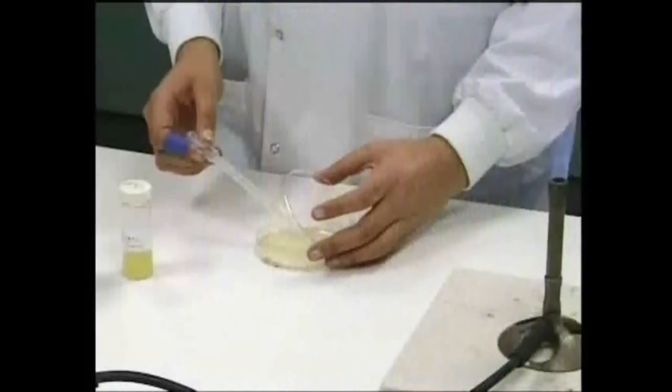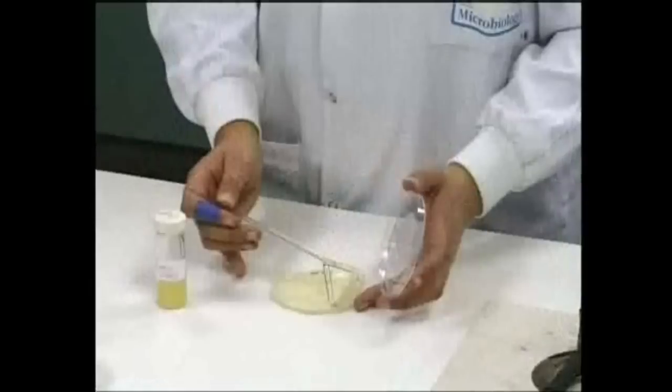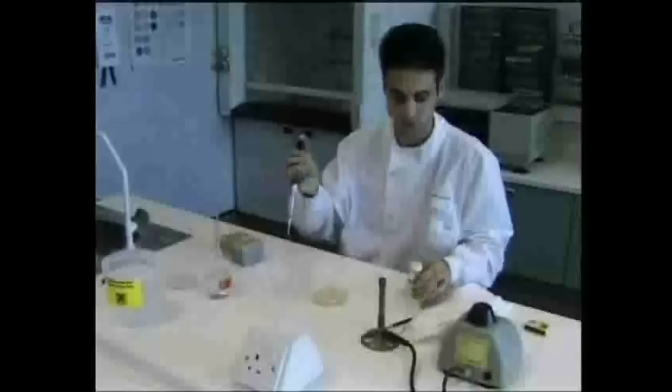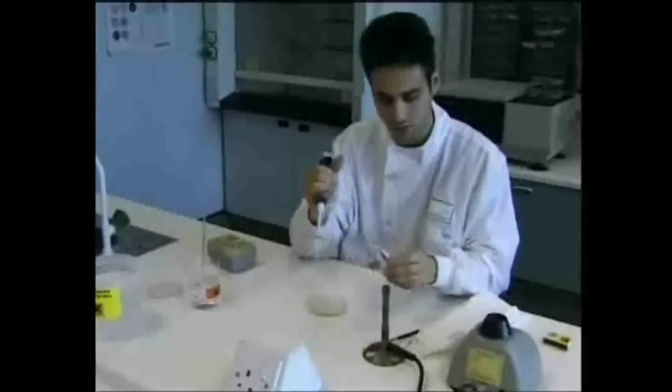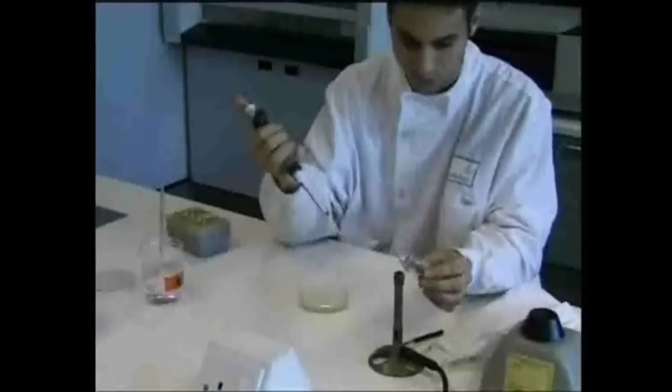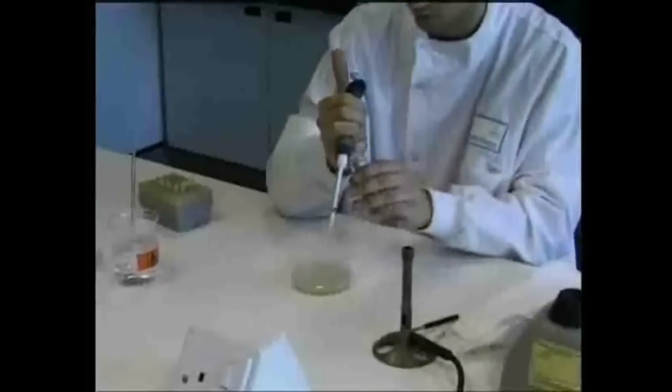A safer way to prepare a bacterial lawn is the spread plate method. This involves pipetting a smaller volume of bacterial culture, up to half a cubic centimeter, into the centre of an agar plate. The lid of the culture bottle is removed and the neck of the bottle is flamed. Using a sterile pipette, the required volume of the bacterial broth is removed.